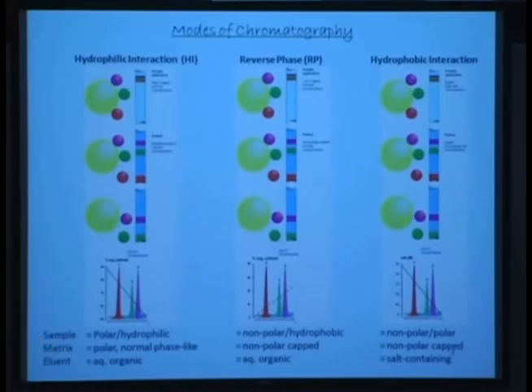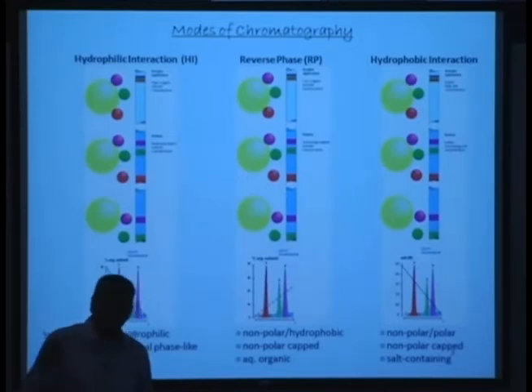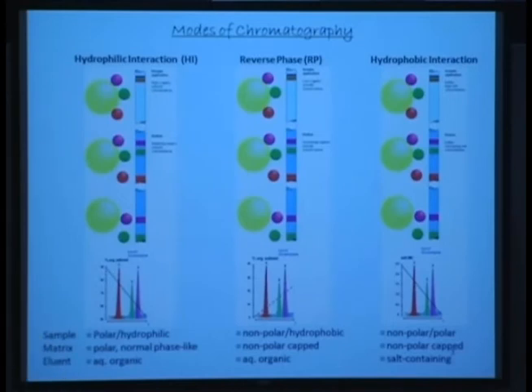The technique that is typically used for highly sulfated glycans is ion exchange. For the most part, it is ion exchange. So here, the eluent is not really close to the assay condition of whatever protein you are trying to use. The eluent here is organic, or an organic-water mixture. That's the difference. And this technique is primarily used for preparative purposes or for analytical purposes. And we don't obviously have the protein involved here.